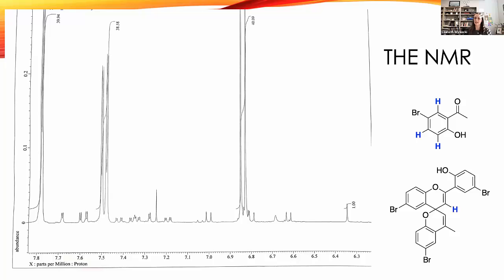Is powerful as an educator because dye synthesis usually is very high temperatures, very long periods of time, kind of a sludge, and then purification outside of that. If you can recrystallize it, amazing, but otherwise dye synthesis can be challenging. So this is a procedure that's both easy to carry out, it's fun for the students, and some of this analysis tells them something about these types of cascade reactions and how quickly products are actually formed.